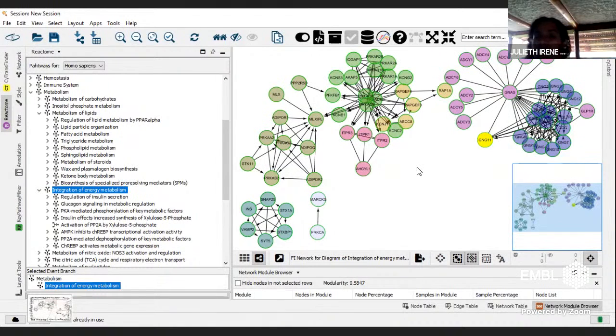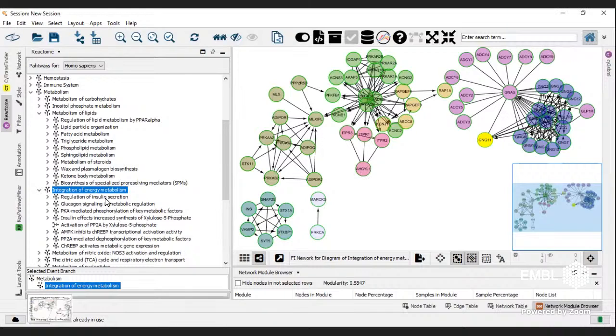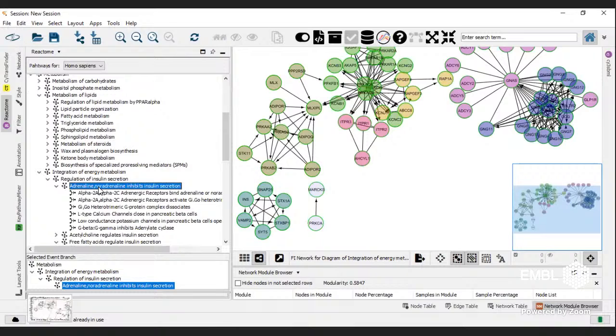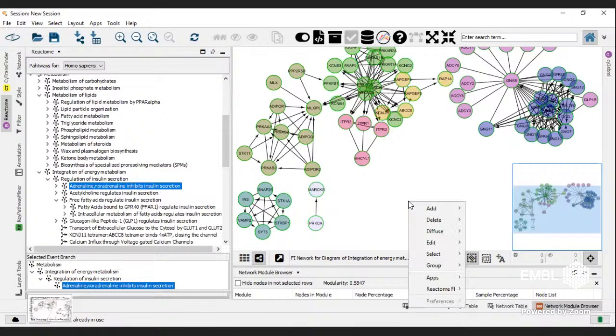Is everyone following? I think so, Juliet. Even if they're not following, I just put in the chat that they should just watch how you did the screen, and then they can follow along. Thais is asking, how do you put the colors? Can you show again this last step, please?